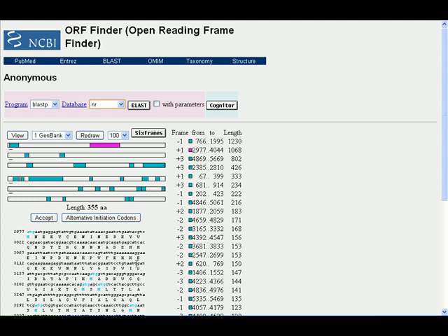This is all for today's tutorial. And I remind you that this software is very basic, so don't use it a lot for complex genes of higher organisms because it's not that accurate.